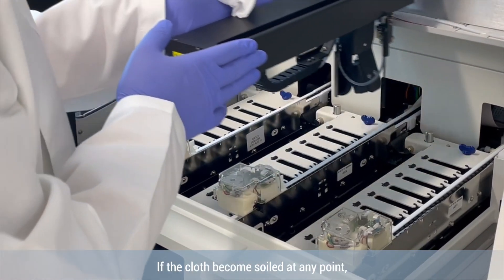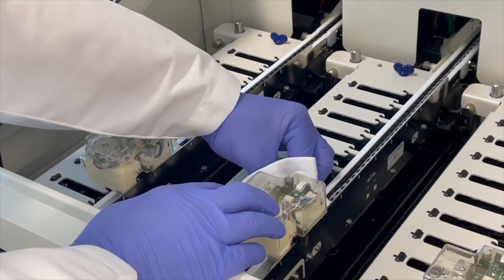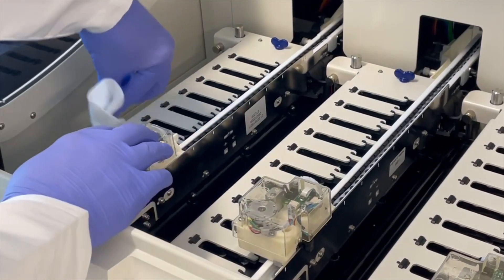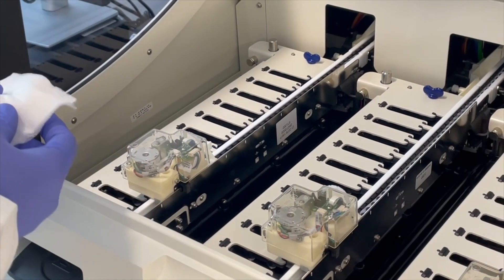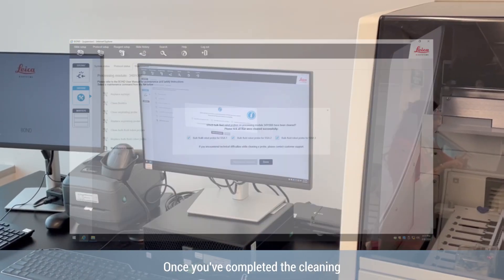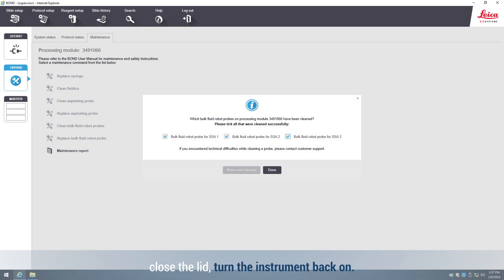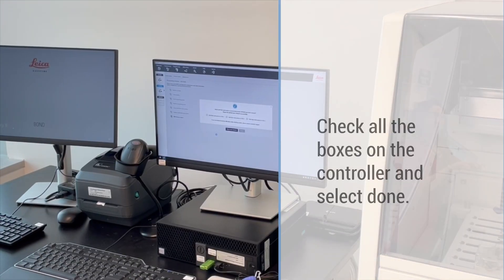If the cloth becomes soiled at any point, switch to a new one. Once you've completed the cleaning, close the lid, turn the instrument back on, check all the boxes on the controller, and select done.